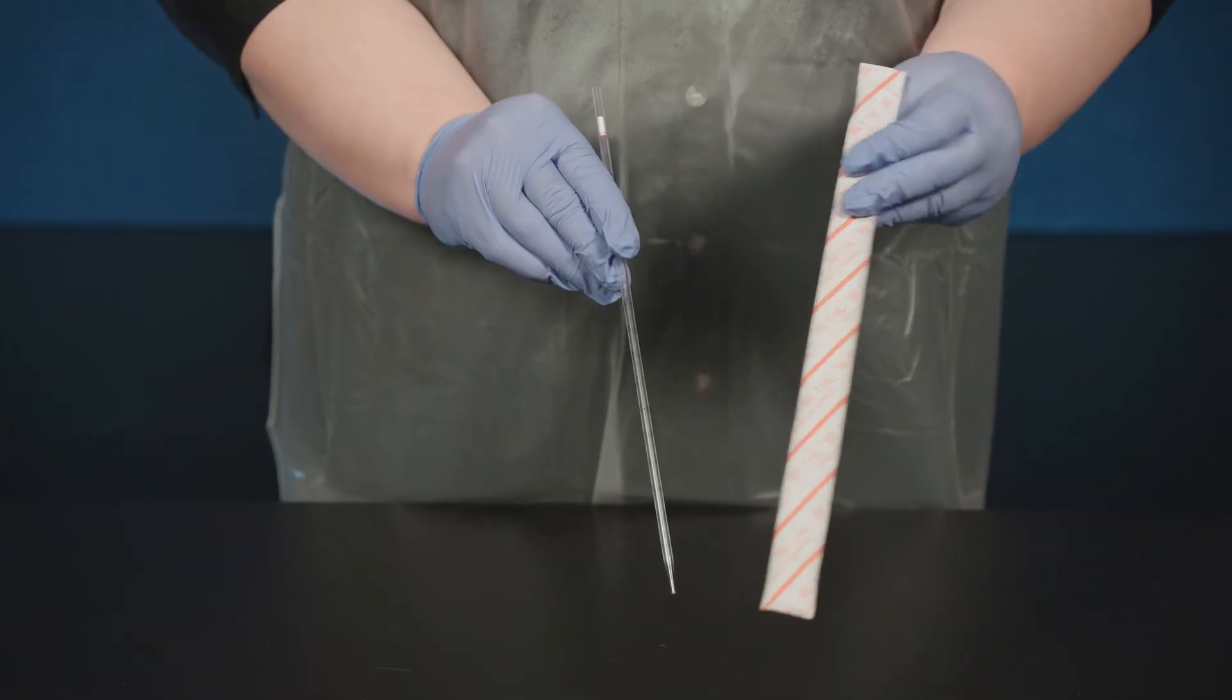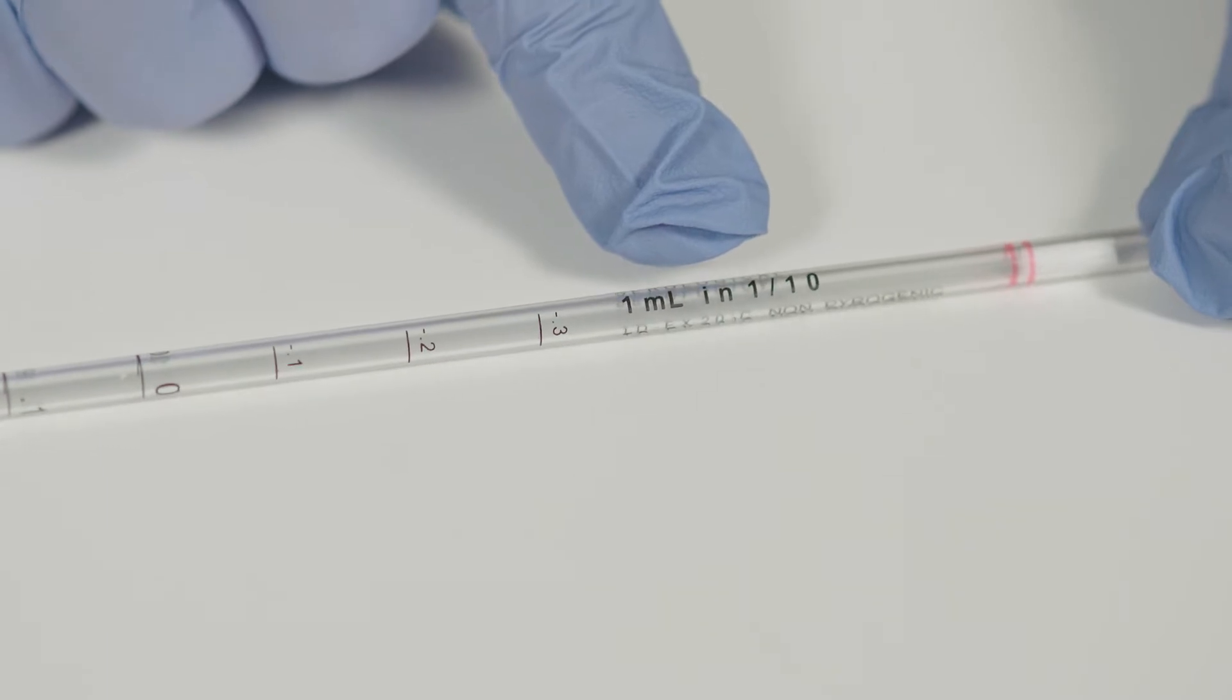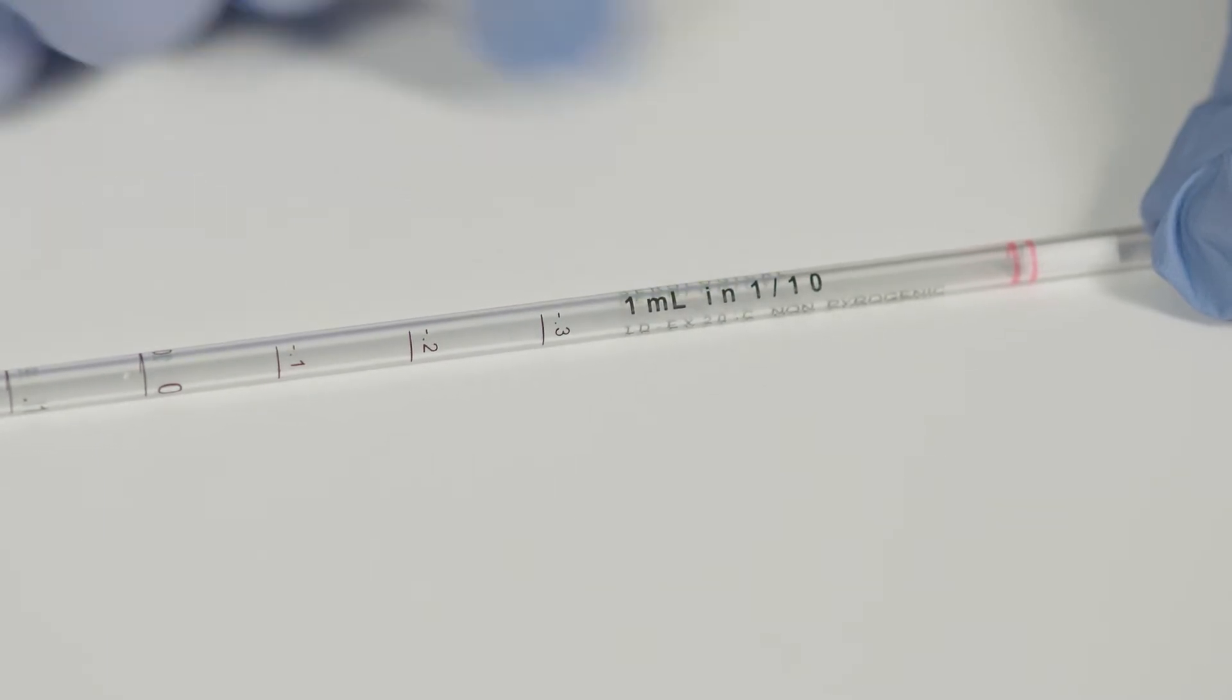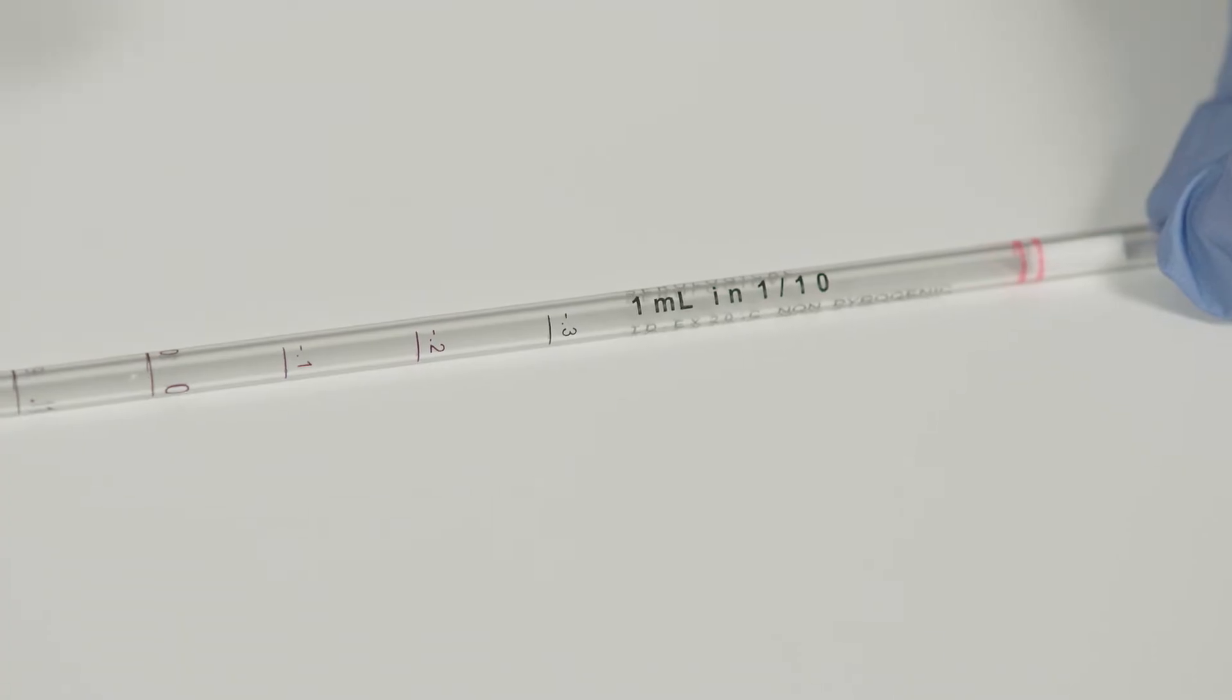Let's take a look at the information stamped on the side of this pipette. Notice it says this pipette measures one milliliter. That is the maximum you can measure or accurately transfer with this pipette in tenths of a milliliter.